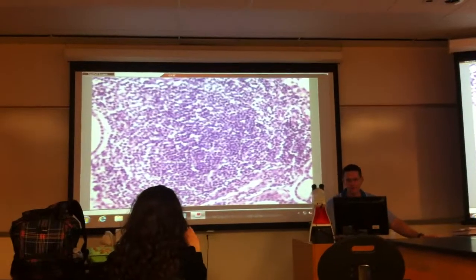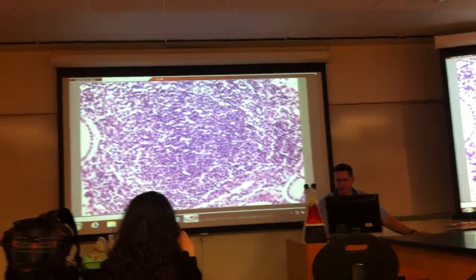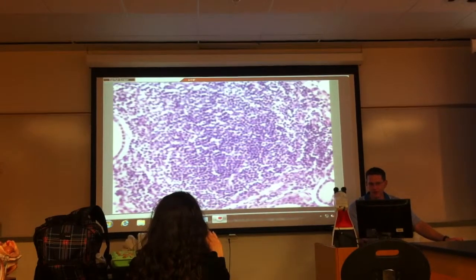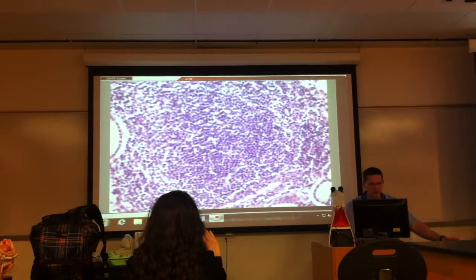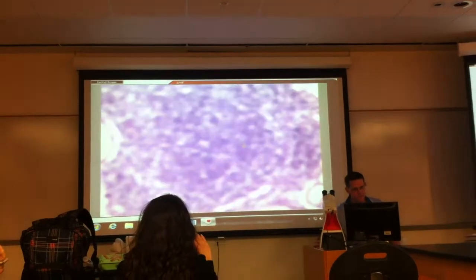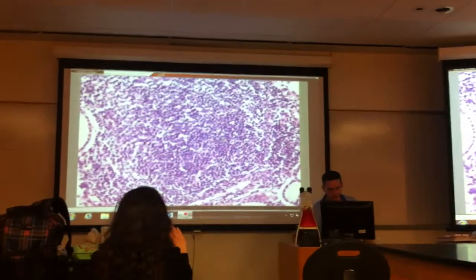You can see that sort of white space around it on the nucleus. So that is an oxyphil cell. And so these bigger, clearer cells are oxyphil cells. Most of the cells are chief cells. I don't know why it won't focus today with this one.